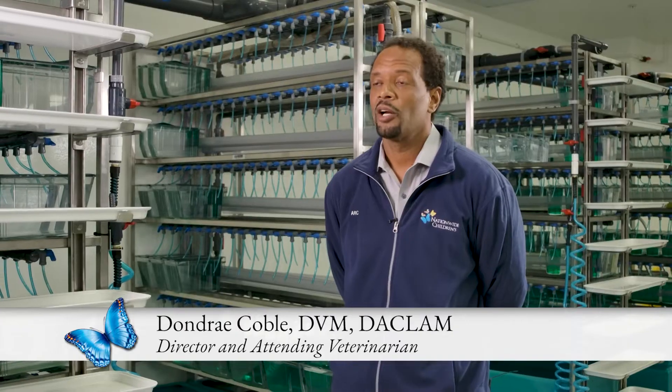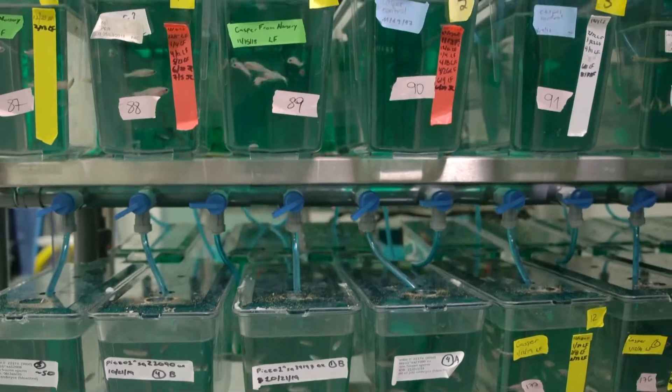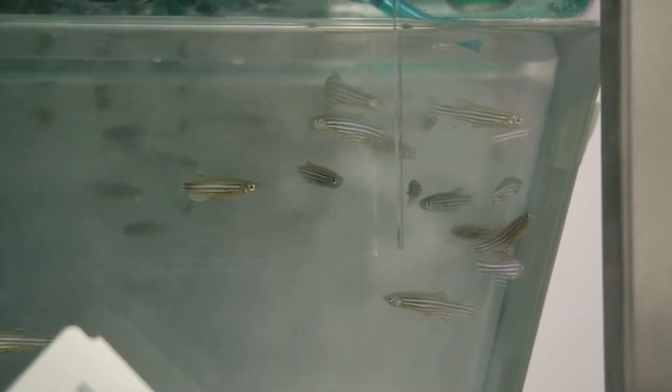Zebrafish are a research model. They're a freshwater fish native to Southern Asia. What sets us apart is our dedication to the researchers here.